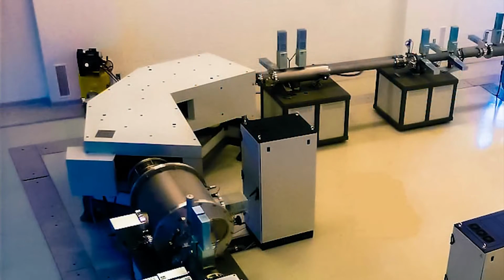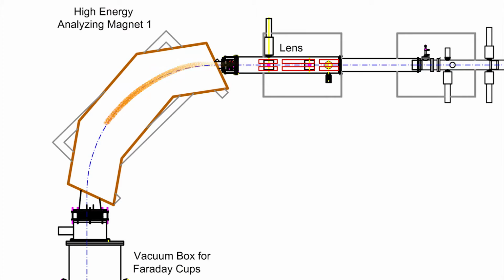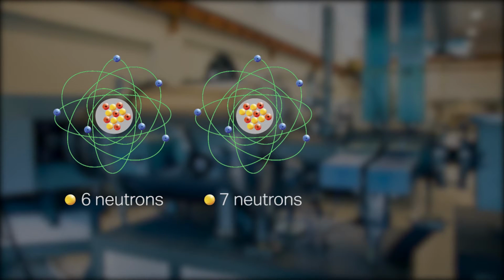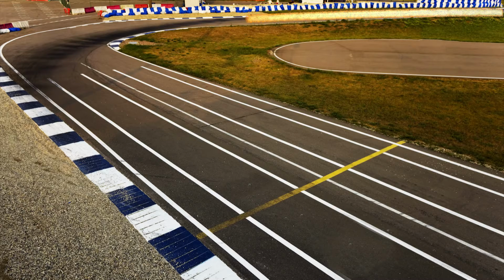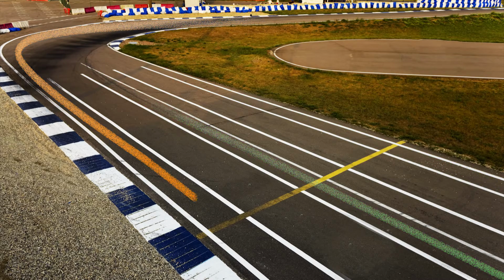So now we're looking at a magnet. It's actually what we call the analyzer magnet. It's 18 tons, and it takes a whack of energy, because we have to bend that beam at 90 degrees. We've got just pure carbon coming down there, but carbon has these isotopes: carbon-12, then carbon-13 with an extra neutron, and carbon-14 with an extra 2 neutrons. And that's the one we're looking for. As we bend that beam, the lighter isotope, carbon-12, bends the most, carbon-13 likewise, but carbon-14 continues on straight down that pipe.